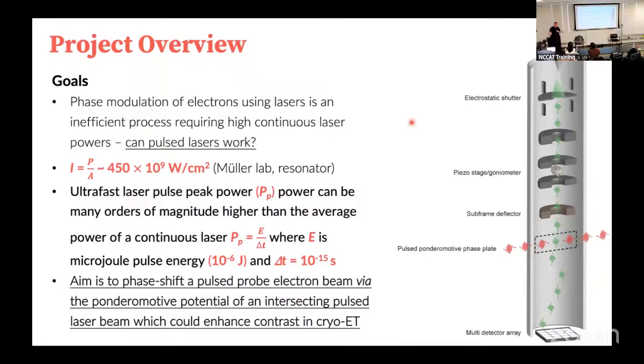The problem with the material is that the material changes over time. So you're trying to heat it, it's emitting electrons, but that's not constant. And so what people would find here and elsewhere is that the phase shift that you would get from the Volta phase plate would change over time. So you would, in, let's say, 45 minutes, go from 0 to 90 and back down again, and then you'd have to sometimes move to a different spot on the carbon.